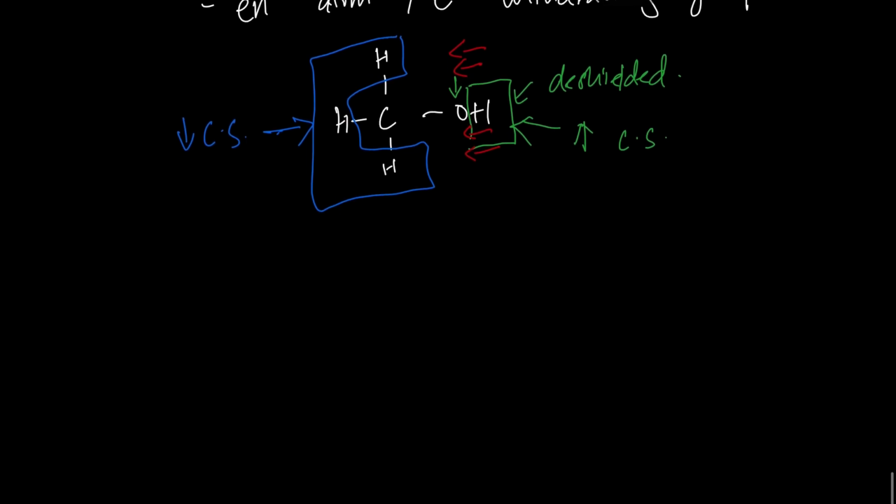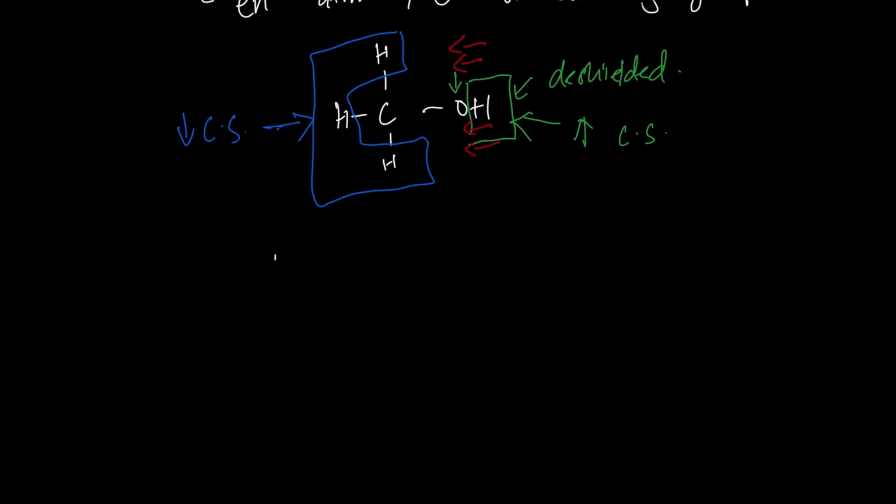Let's look at another example. Another structure, CH3, CH2, CH2, NO2. This NO2, nitro, is an electron withdrawing group. So we have three signals here, three non-equivalent protons, 1, 2, and 3. The distance between the proton and the electron withdrawing group will also affect the de-shielding effect. Of course, the one which is nearer to the electron withdrawing group will have a greater de-shielding effect.